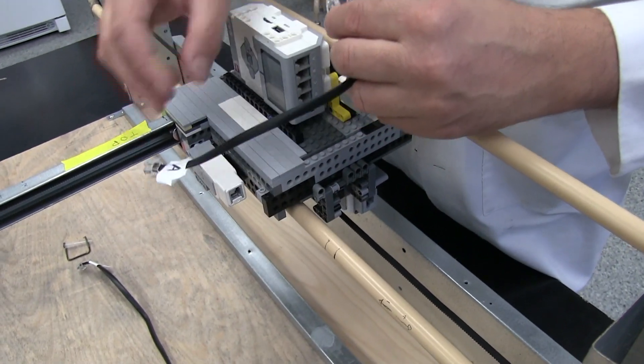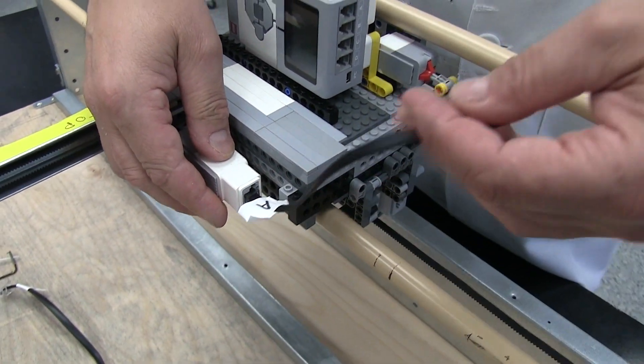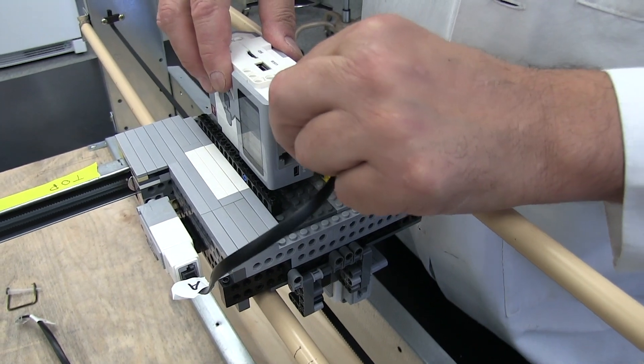Here, we will connect the motors to the EV3 unit using LEGO Mindstorm Kit cables. This will allow the EV3 unit to control the motor action of the platform.